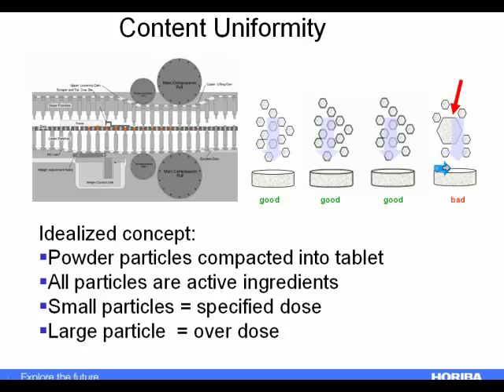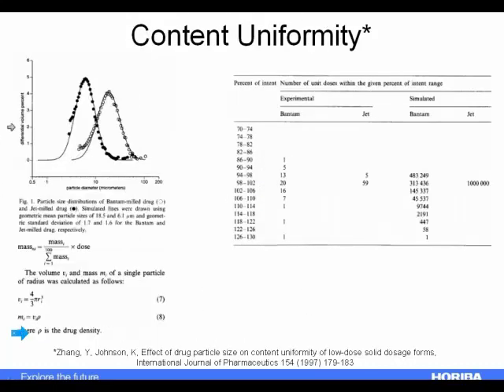And that can cause a big problem, and actually I could show you several references where materials are pulled off of the market just because particle size distribution got out of control, and this leads to concerns with content uniformity. So there is a lot of concern, especially with larger particles, in terms of setting specifications to assure uniform dose in the material being delivered to the patient. That was kind of a qualitative view.